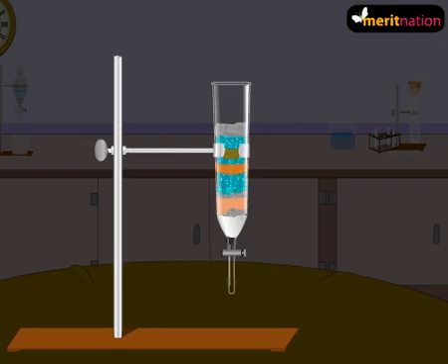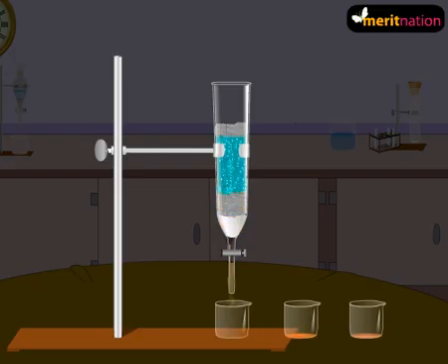The component that is more weakly adsorbed will move faster through the column and therefore will get separated first. The component that is most strongly adsorbed, as expected, will be separated the last.